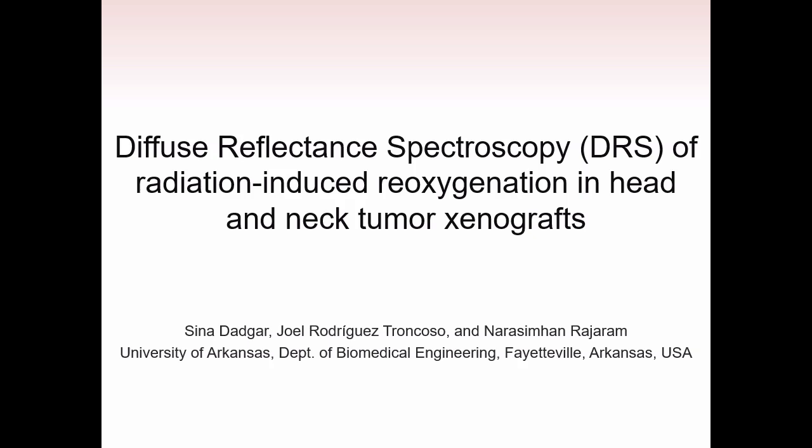For the introduction. Hello everyone, my name is Sina Dadgar, second year PhD student at the University of Arkansas. Today I'm planning to talk about characterizing reoxygenation kinetics in head and neck tumor xenografts using diffuse reflectance spectroscopy.